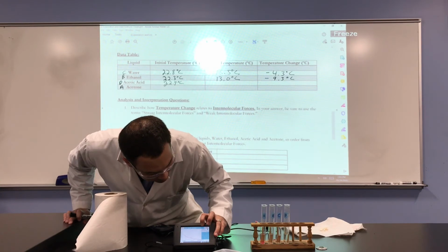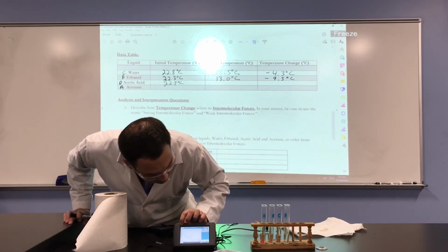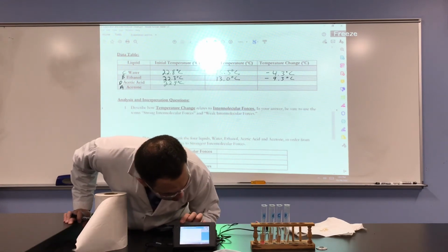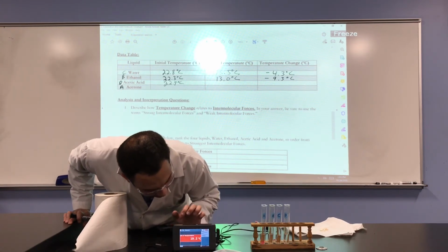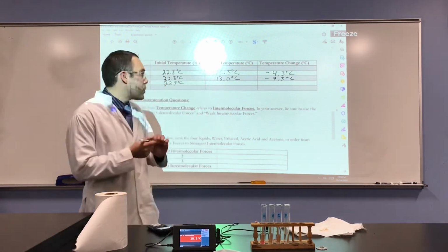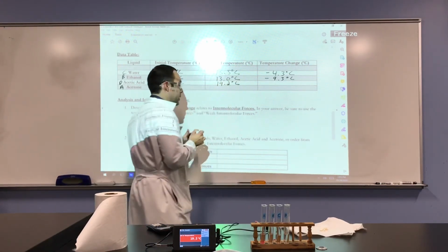At 170 seconds, 19.2-ish, 19.3. We're at 19.4. Oh, we just ended, and we're at 19.2. That was our lowest point anyway, 19.2 degrees Celsius.